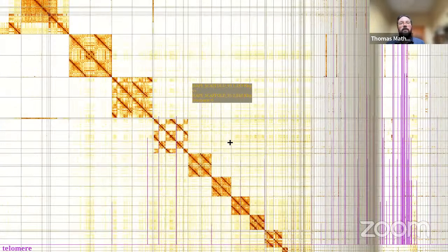And basically, if you had a small contig on its own here, but it didn't have this dark yellow off-diagonal signal, you might be suspicious of that one and think, actually, should that be something that belongs in one of the larger chromosomes? It's just a bit that's not been placed. So we're always looking for that enriched background signal.